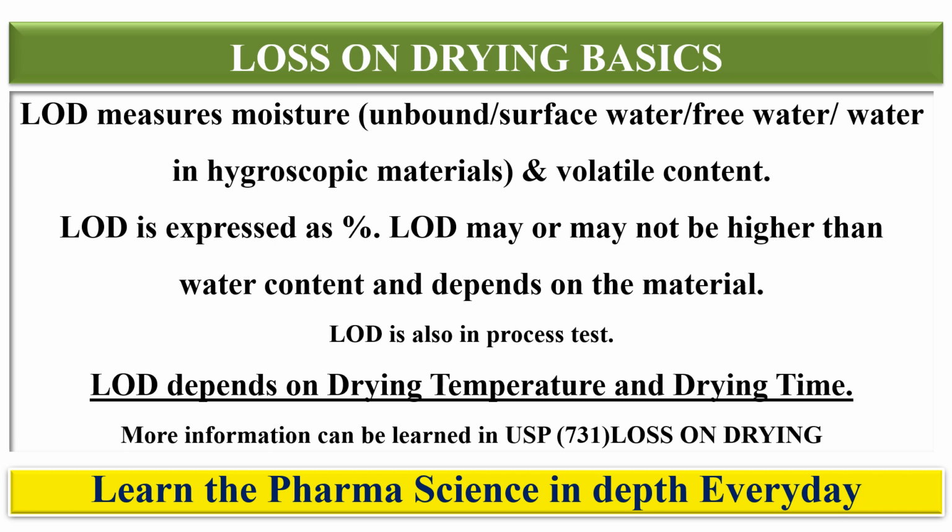LOD is the test which mainly depends on drying temperature and the drying time. If you dry the material for a longer time, then there might be a slight difference in the LOD values. Drying temperature also has an impact on the LOD values. More information you can get from USP 731, that is loss on drying.